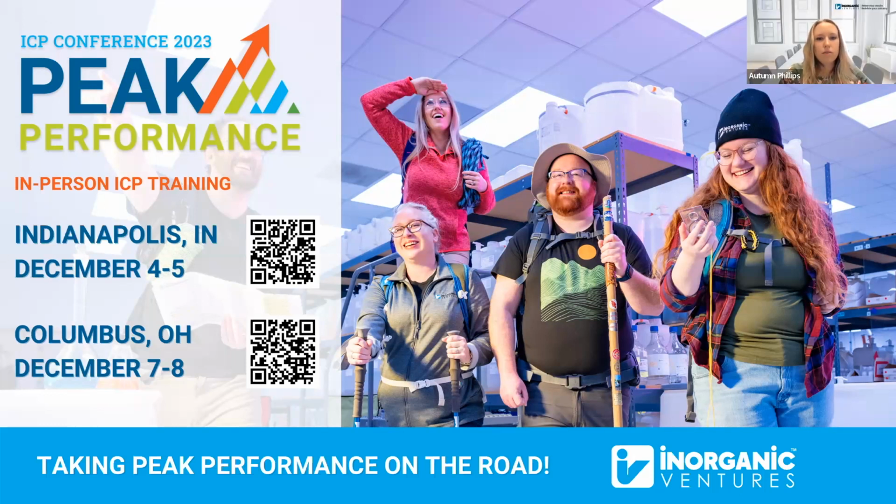To help with droplet formation, you could also soak your spray chamber. If you're seeing poor precision or degradation of your signal, you could try soaking it in a surfactant solution. We use RBS 25 at 25%, and we just soak the spray chamber for a little bit and then wash it off, obviously really thoroughly, with water. That can help recondition the surface of your spray chamber so that those droplets can't form as easily, and you'll get a better mist from that too.